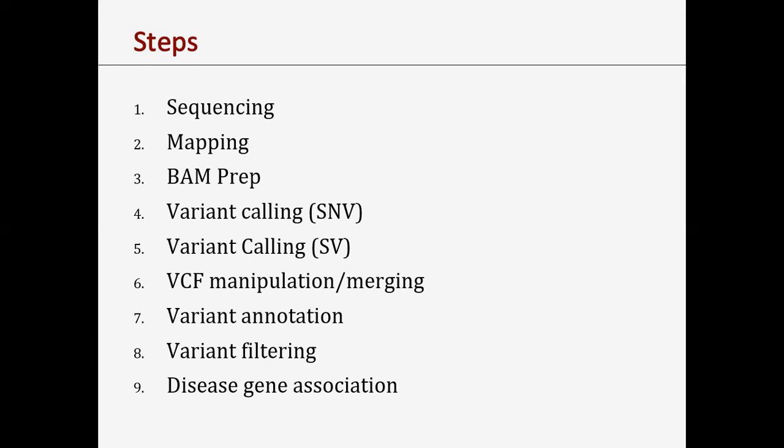Say suppose you have a very rare disease where the genes are not mapped and less information is available. You can go for whole genome. From whole genome, first you can look at similar phenotypes, look for the phenotype-gene association, take the gene list, and analyze those genes. If they are not there, then you can look at other coding regions. And if you don't find any coding variant, then you can look for non-coding region variants. From the same whole genome data, you can apply different pipelines for calling different types of variants. So you can call SNPs, copy number variations, indels, and large insertions and deletions. There are different pipelines you can apply on whole genome data.